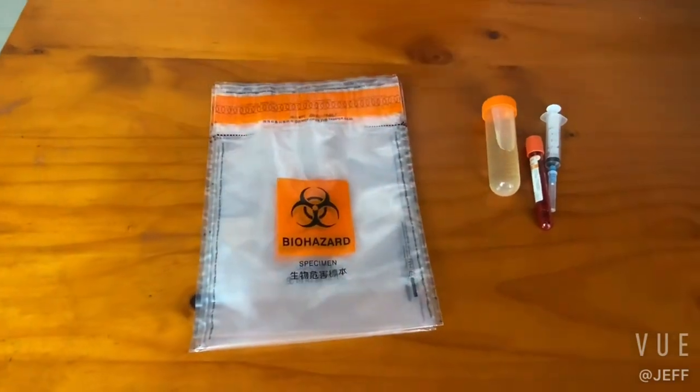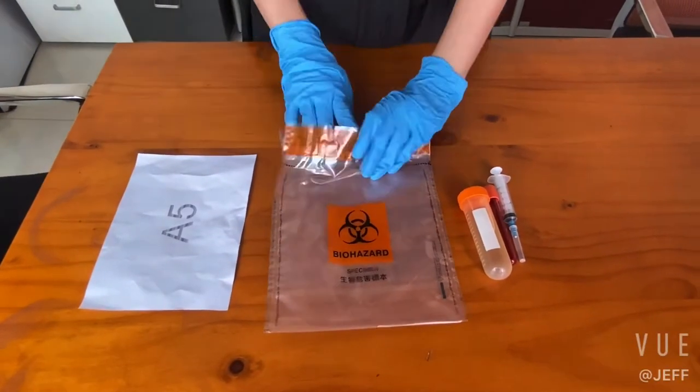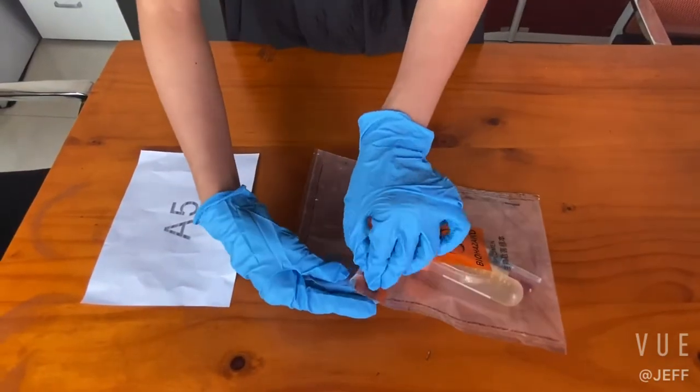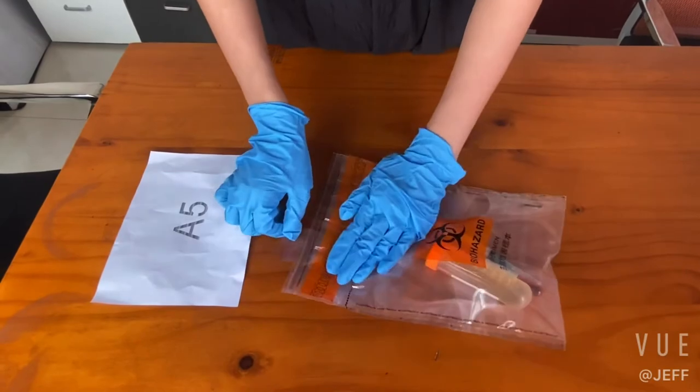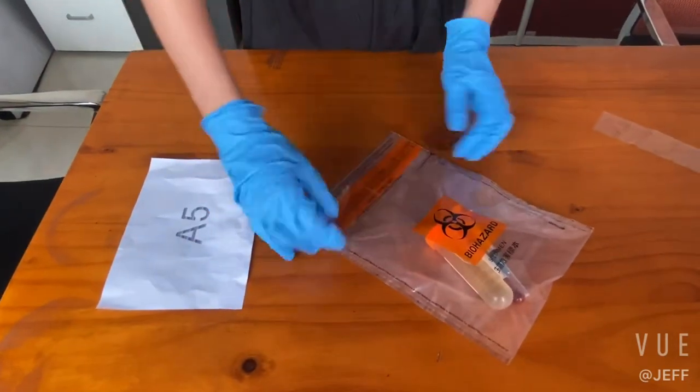Now let me display how to use this bag. Put in the biohazardous materials, and then take out the film here, and seal the bag. It's very easy.